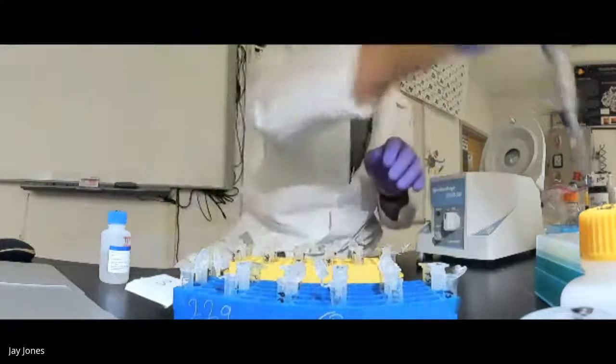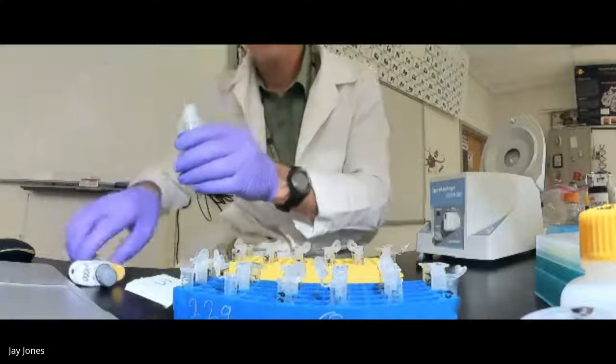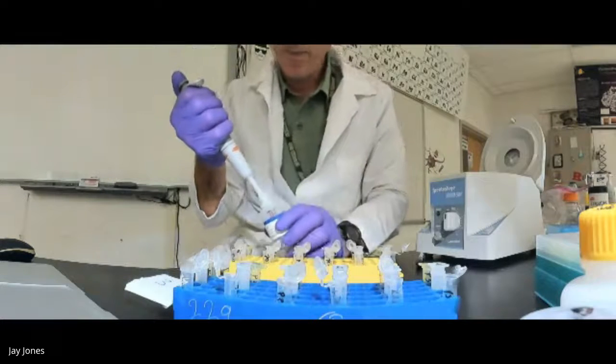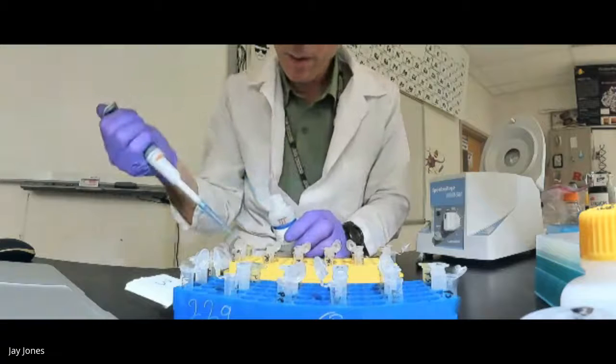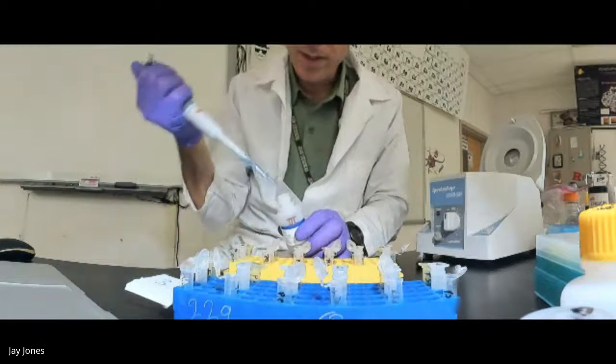Hopefully. Here we go. Solution three. Solution three is an acid. I'll start period 12 again. Here we go. T1, T2.